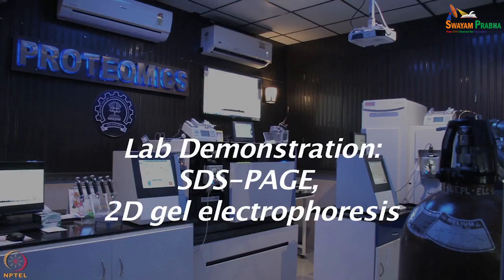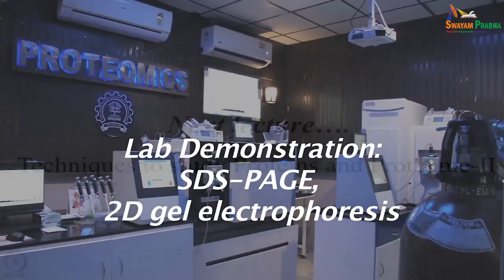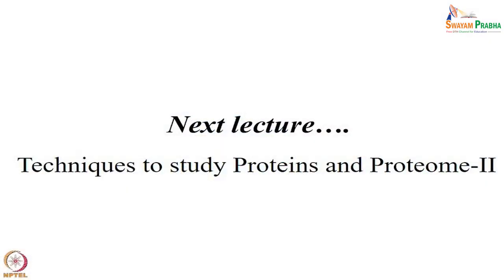And each spot actually reflects the isoelectric point and the molecular weight of a given protein. So I hope now you have a much more confident understanding of performing a 2D gel based proteomics experiment. In the continuing lecture, we are going to discuss some of the pros and cons of using 2D electrophoresis and how it can be made more robust and more quantitative for various other applications. So let's continue the discussion on technologies in the next lecture.